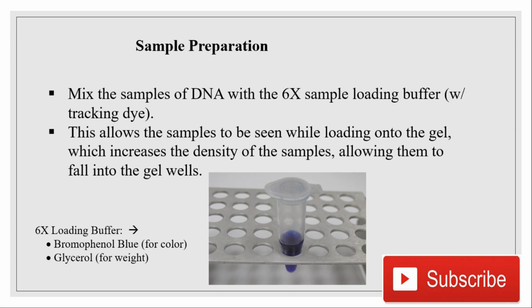After that, while loading the samples, the DNA sample is light in weight, so we treat it with loading buffer. Loading buffer is composed of bromophenol blue and glycerol.